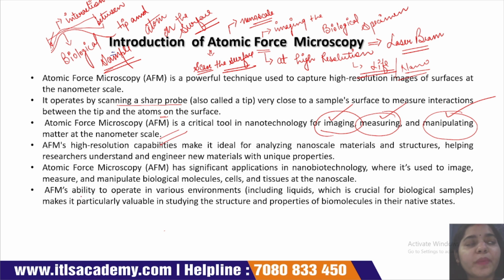Atomic force microscopy has the ability to operate in various environments, including liquid, which is crucial for biological samples. This makes it particularly valuable in studying the structure and properties of biological samples in their native states.